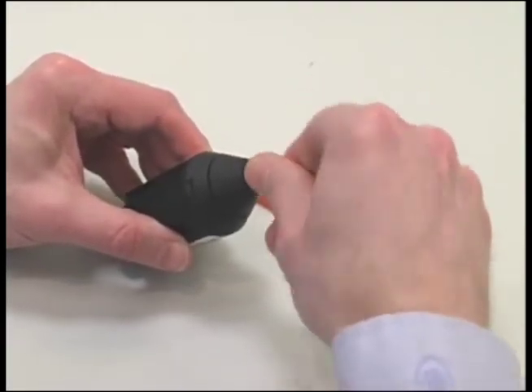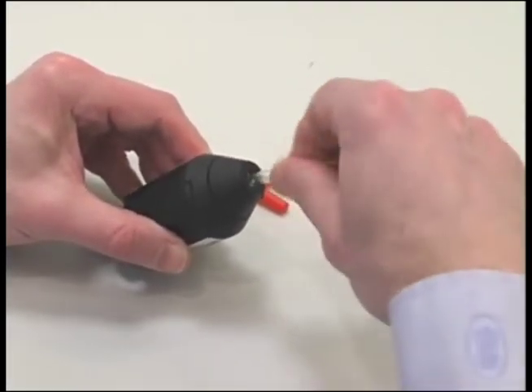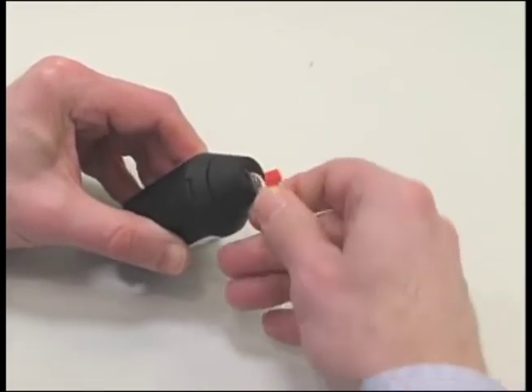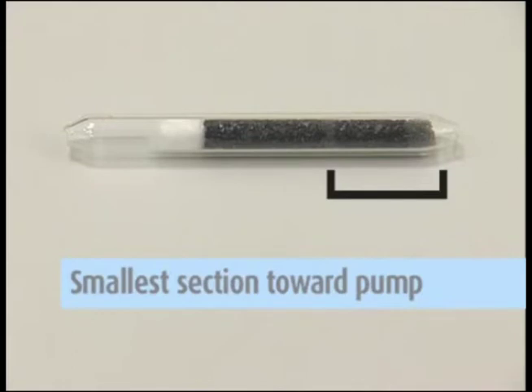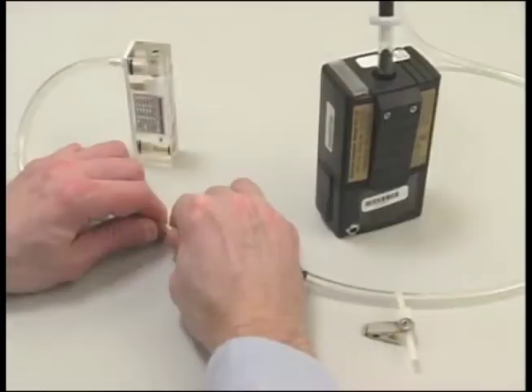Use a tube breaker to break both ends of the sorbent tube to provide an opening at least one half the internal diameter. Insert the open sorbent tube into the adjustable low flow holder's rubber sleeve with the arrow on the tube pointed toward the holder. If the tube does not have an arrow, place the end of the sorbent tube with the smallest sorbent section — the backup section — into the tube holder toward the pump.